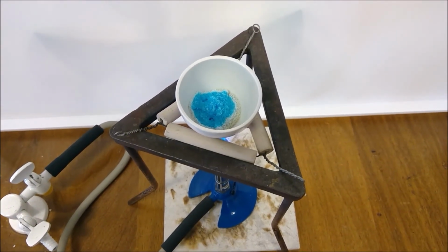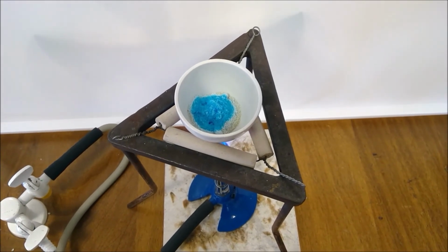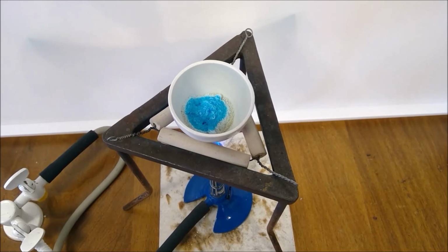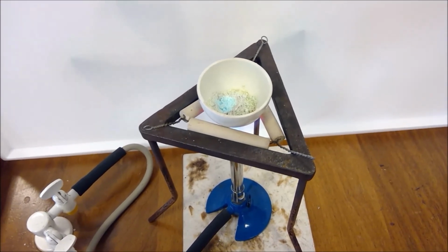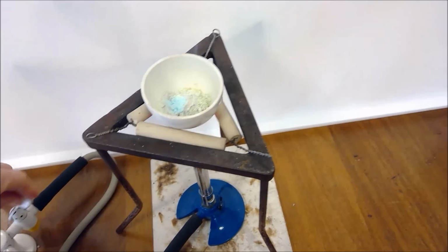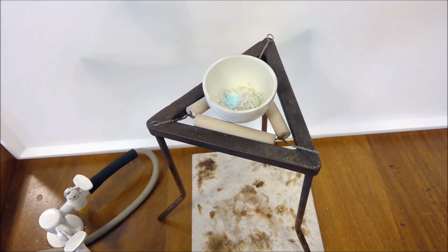Right, take a quick peek. We're about 2.5 minutes in now. And is that looking how you would expect it to look? So now we're at the 5 minute point. So I'm going to switch the gas off and remove the Bunsen burner.